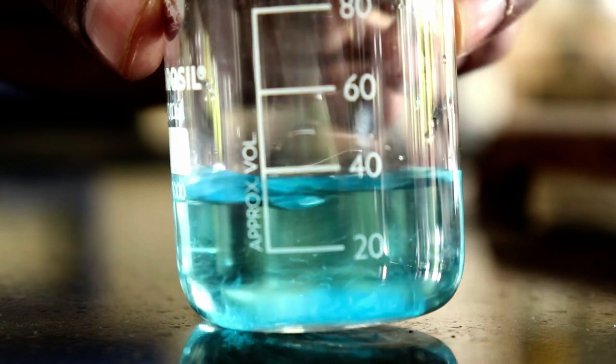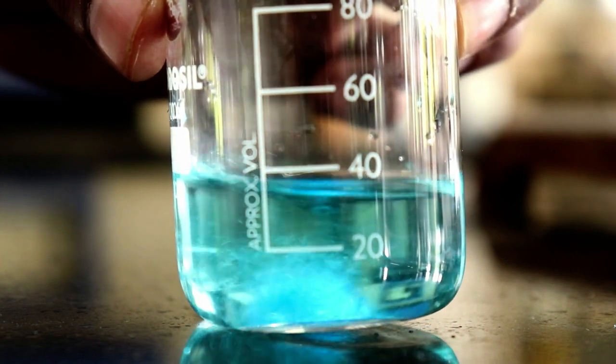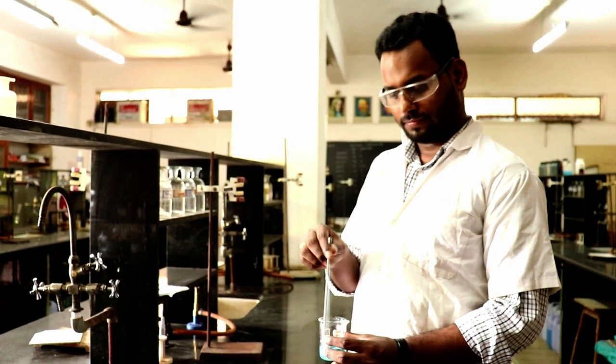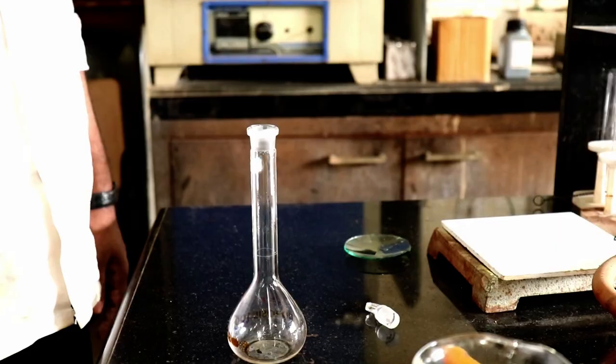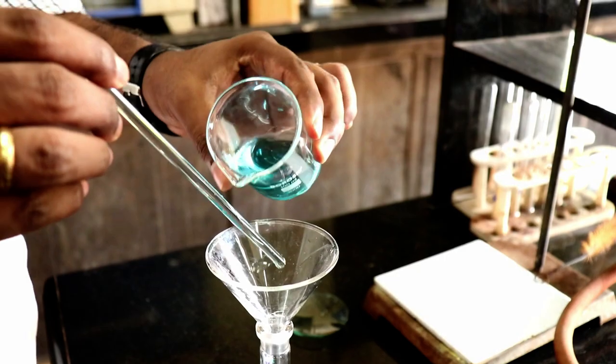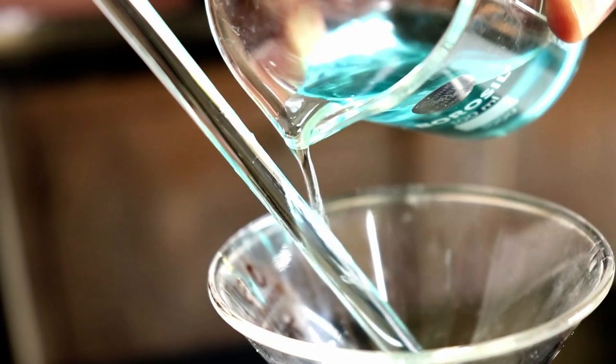Stir it gently with the help of a glass rod. Please don't bang the glass rod on the walls of the beaker. Now place a funnel on the standard measuring flask. Transfer the solution to the standard measuring flask like this.